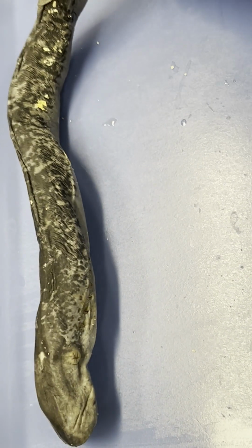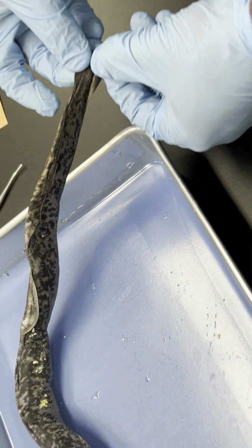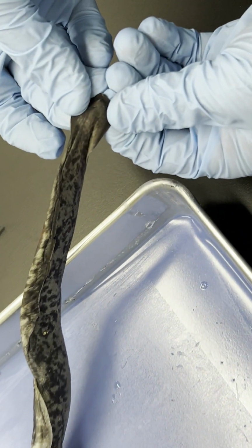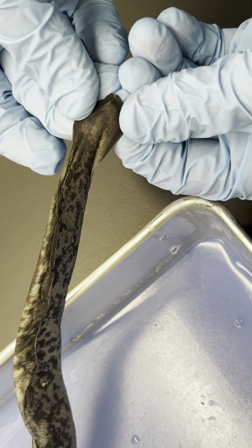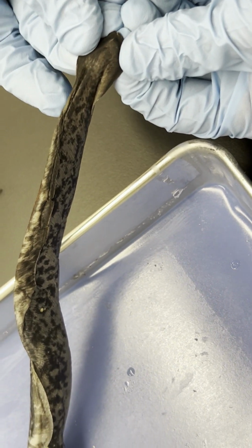The other external feature that we're actually going to see is towards the end. This is the caudal tail, or the caudal fin, which is by the tail of the lamprey. And this is how it pushes forward. It's basically its propeller as it's swimming underwater, okay?